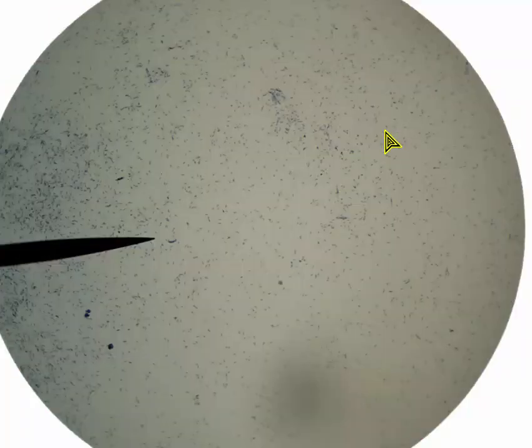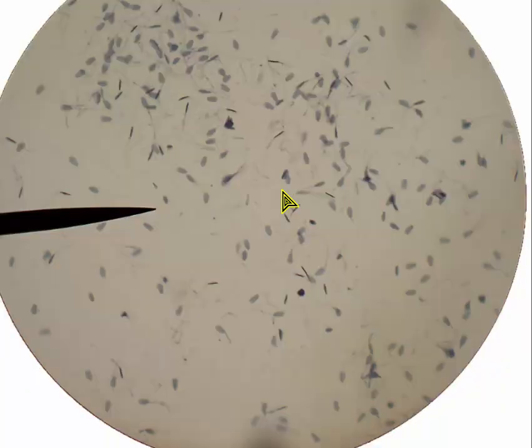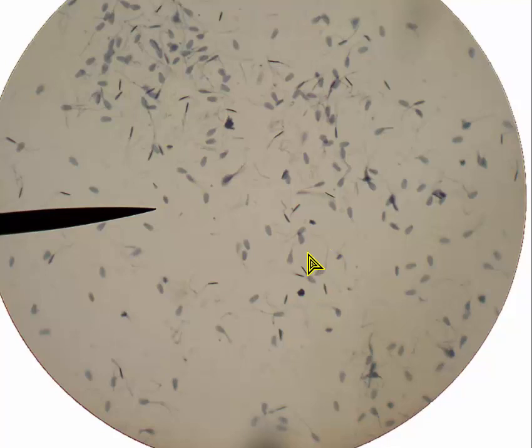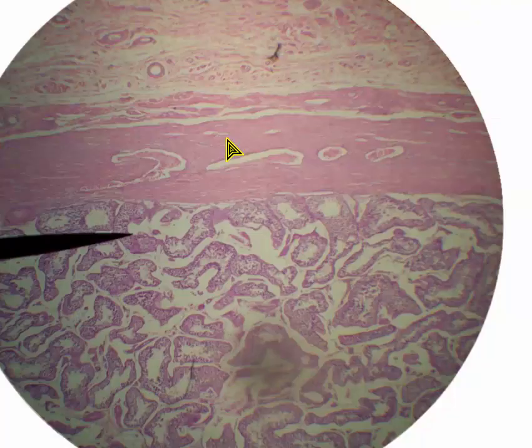Moving on to the next image, also for reproductive, this is 100 times magnification. These are actually sperm — bull sperm, but human sperm look very similar. At 450 times magnification, you can see the heads of the sperm and you can see the tails. So we've seen sperm, testicle, and ovary.